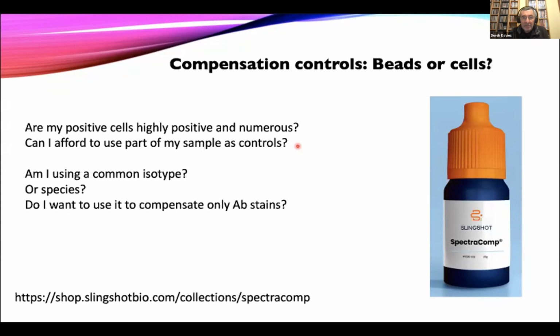However, today, this is what we're going to be using. We've teamed up with Slingshot Bio today, who provided us with these SpectraComp beads, and Kathy will talk a little bit more about those when we come to the practical part in a moment.